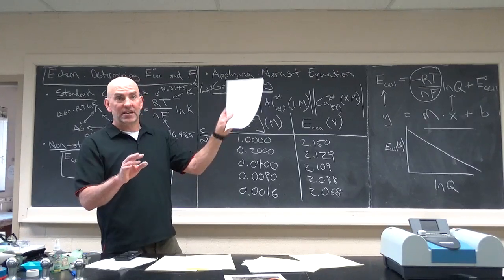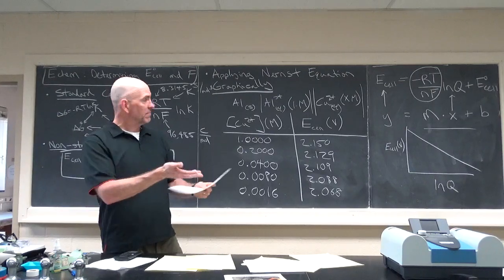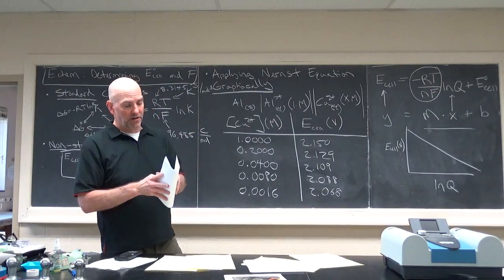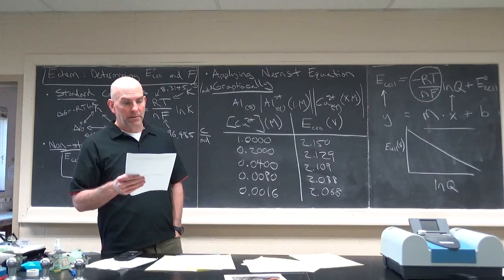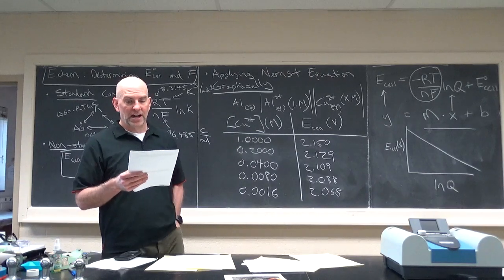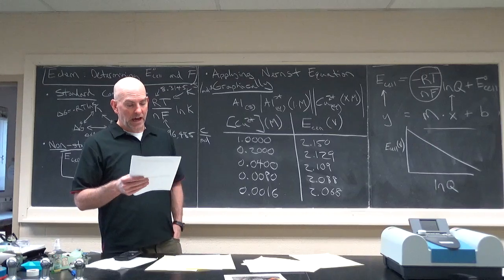So I'm just looking at the calculation section. It says you've done the graphs, okay. Record your experimental slope and intercept in the space below. Okay, fine. Use the information from the slope and the intercept to get the Faraday constant and E0 cell, fine. Number 3 is using the table from your book, determine the theoretical E0 cell.